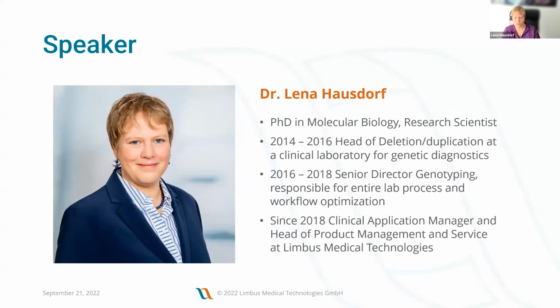It was not originally in our idea because we said we are going for clinical diagnostic labs, and this is more of a research topic, but a lot of our customers also do research. So this has come up quite often, actually. Yeah, so there's an overlap between research and clinical diagnostics.